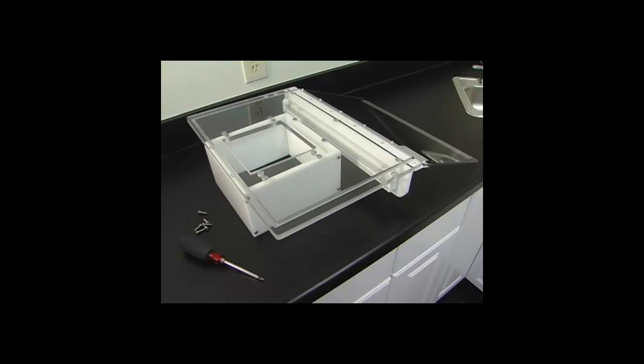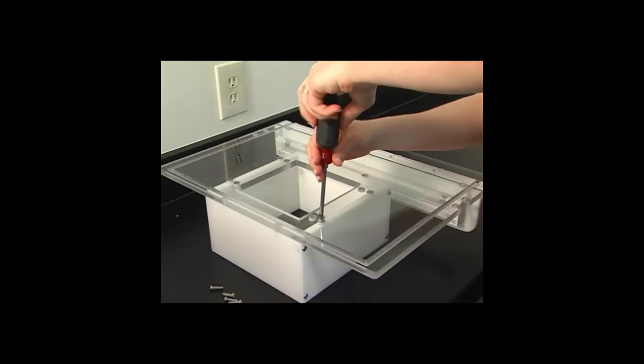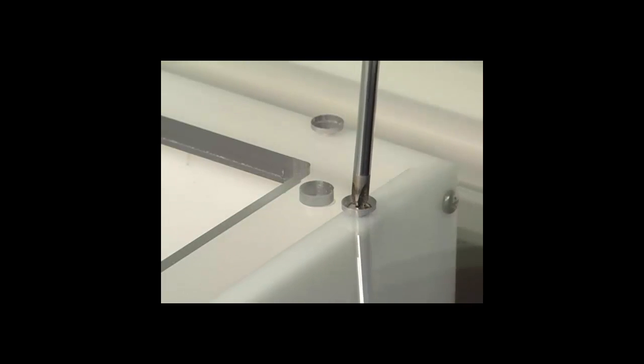Next you will need to screw the square filter box onto the top panel with six screws. This should be on the same side of the panel as the support bar.